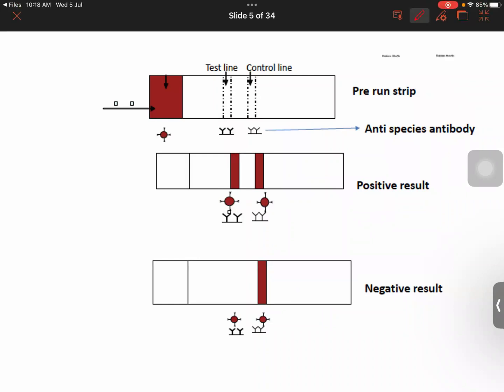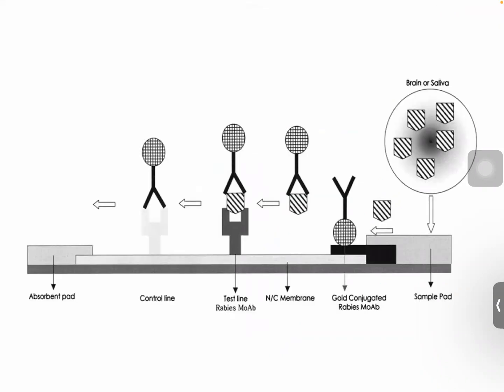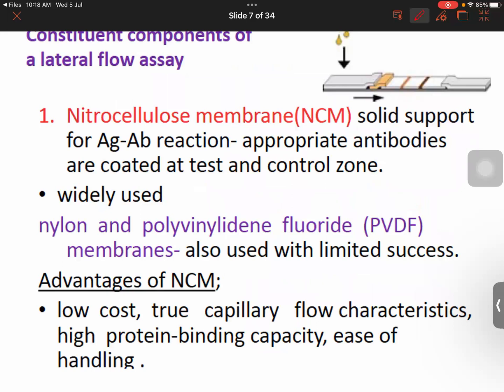Okay, the structure of where you get this is the test line and this is the control line. So if it is negative, you get only the control line, whereas when you have positive, both lines appear. Okay. So this is basically how to control the sensitivity, as well as whether you are going to get a good result or results that are difficult to observe.